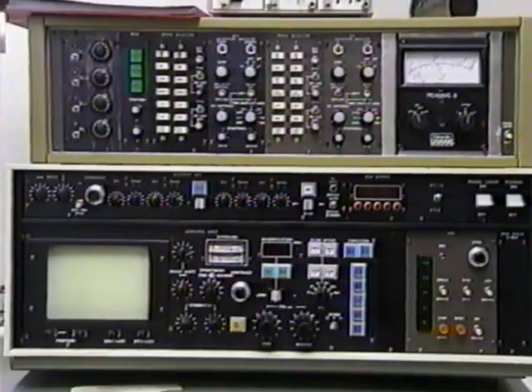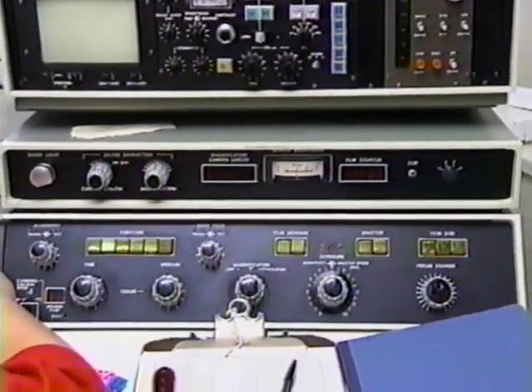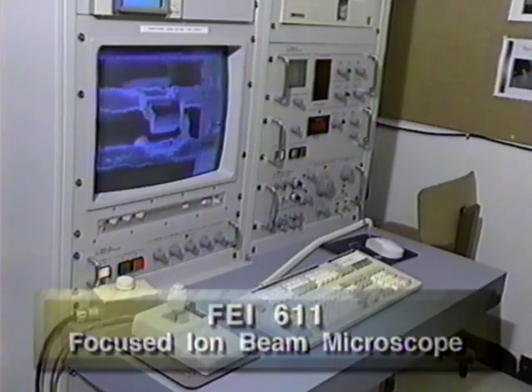And in this one, we can digitize the image so that we put it in a computer system, and then our lab is networked so we can print them directly out to the printers, or we can even send them to clients if they want to look at a particular sample. We can send them directly over the internet if they desire that. Most of the time we do print them out anyway to have hard copies, and of course if they're for student projects they have to turn in the projects.